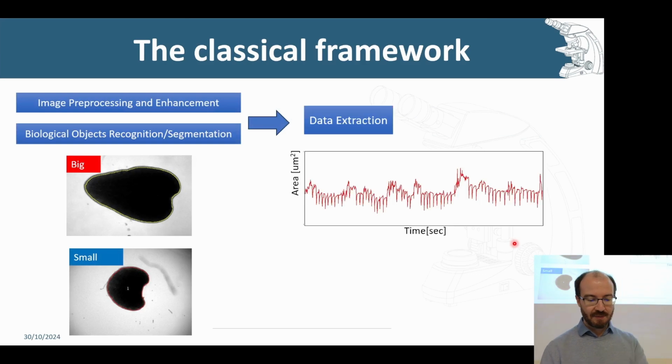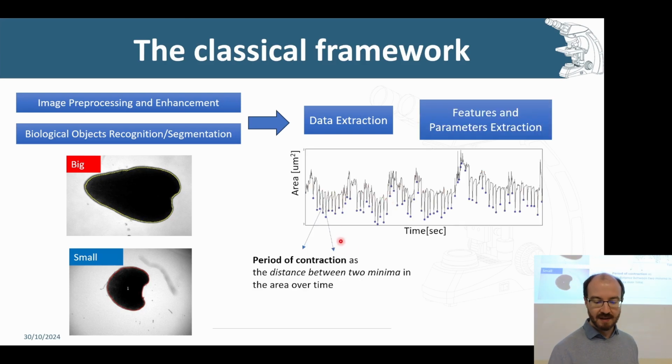So okay, now we've enhanced it, we've made these selections around it, and let's say we look at the perimeter, or in this case the area, doesn't really matter, both of them would give you the same type of information, and then we can say, okay, over time, how does this pulsing happen? And then you can see there are these periodic pulses that happen, so then you can either do this for all of the peaks and then average it, or say how many pulses happened within a certain time frame, and then you can get it from that.